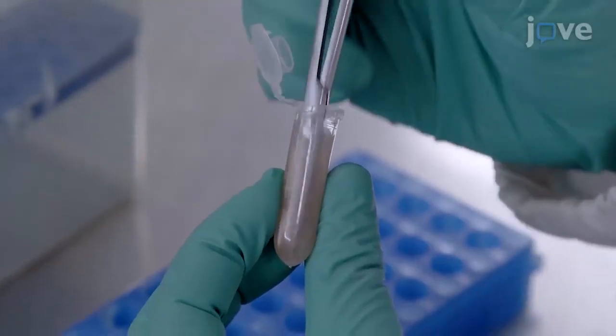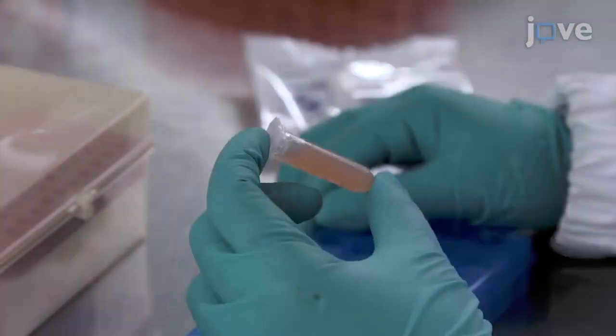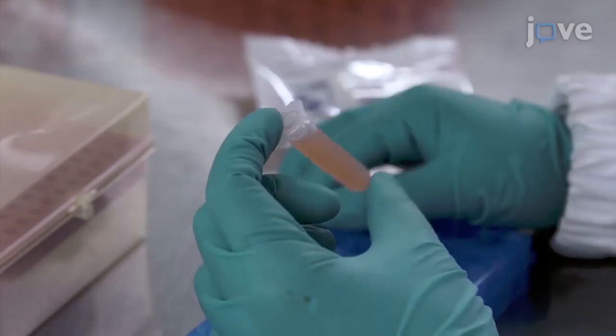To the new researchers to this field, we believe that the indicated simplified protocol should be a good choice to get success.